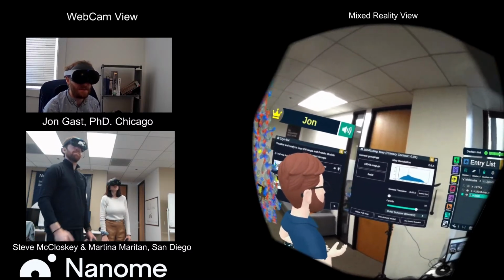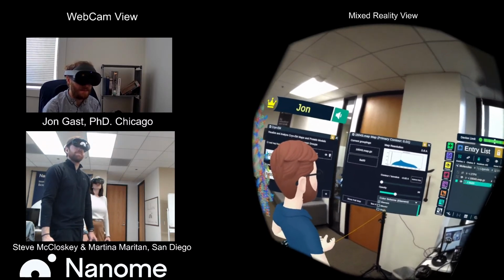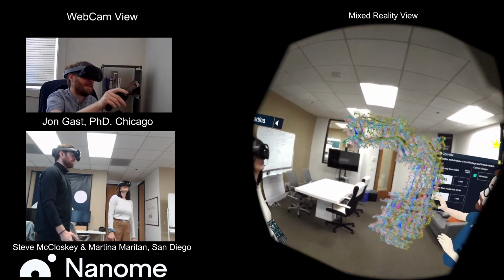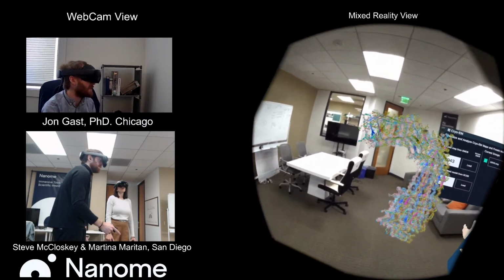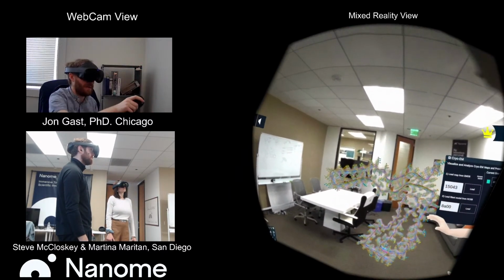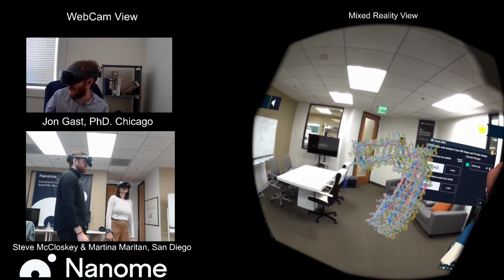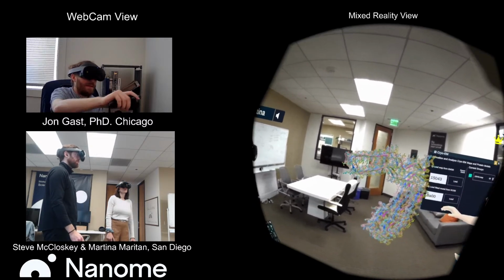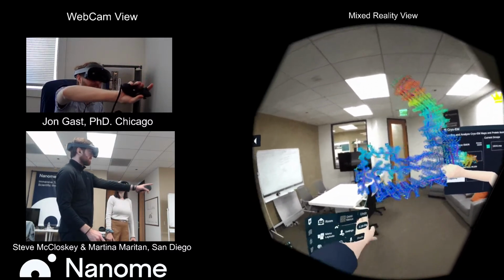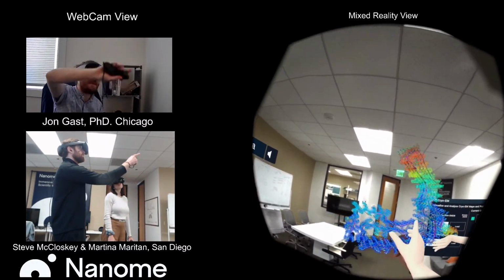And one thing I also like to do is, we do have some other options. So here we're looking primarily at the element, but we can also color by chain, which I'll admit for this case is not as obvious. But if you had something like a ribosome or something else that has lots of subunits, being able to quickly distinguish each layer of everything going on. But the really fun one we were looking at earlier is looking at the overall stability or movement here, B factor. So we can see it's a dark blue, and in Nanome for B factor, we go from blue cold, so very low, very stable, to hot red, along that spectrum.